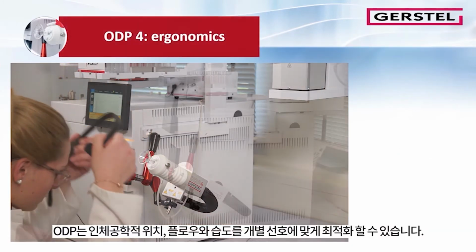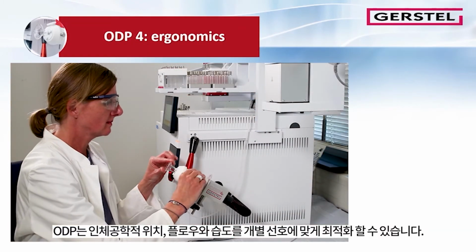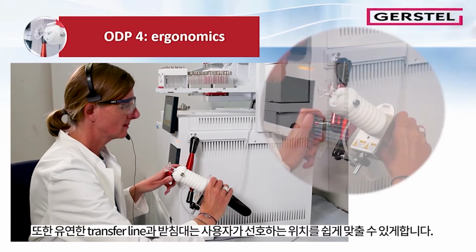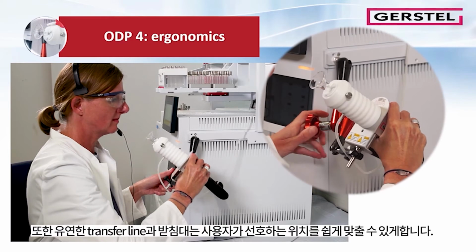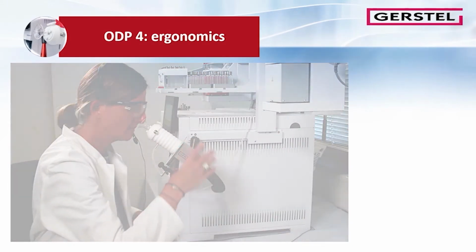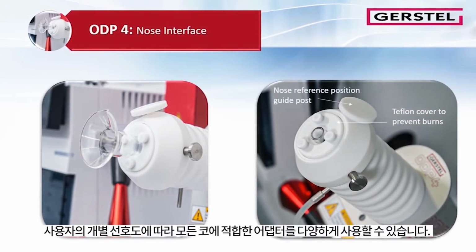The ODP can be optimized for individual preferences in terms of ergonomic position, flows and humidity. Easily conforms to the analyst's preferred position through flexible heated transfer line and support arm. The right adapter for every nose. Depending on individual preferences of the analysts, different setups can be used.